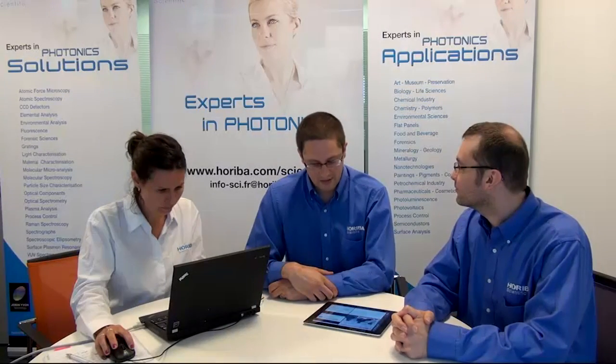Thank you. Another question. I am a Fluorolog 3 user. Is a CCD detector available on my system? So yes, it is. The Fluorolog is one of the most sold systems in our portfolio, and it is based on scanning emission and scanning excitation monochromators.